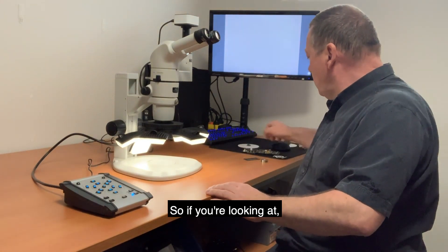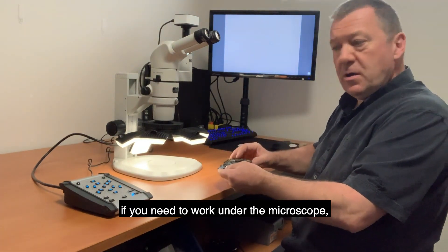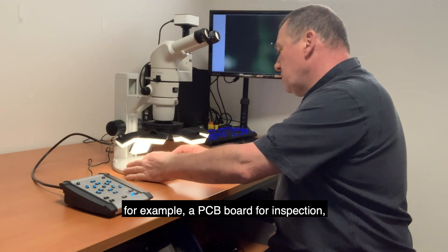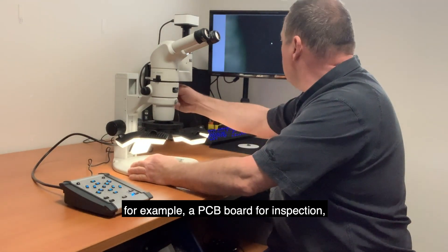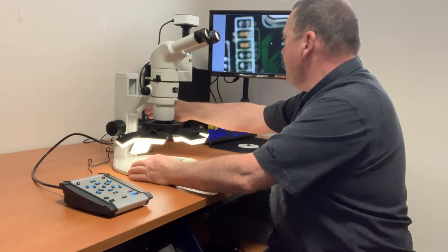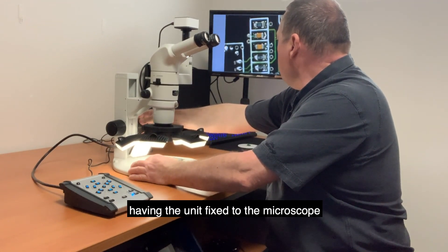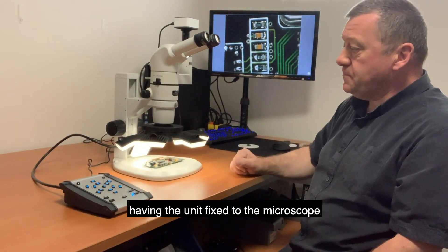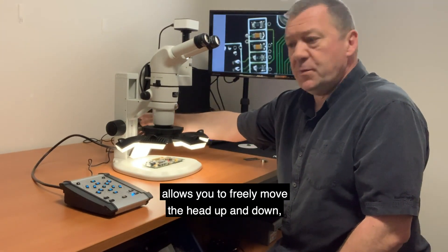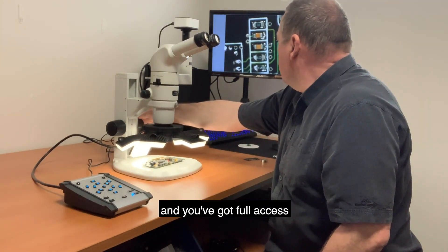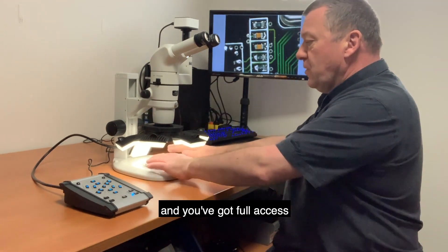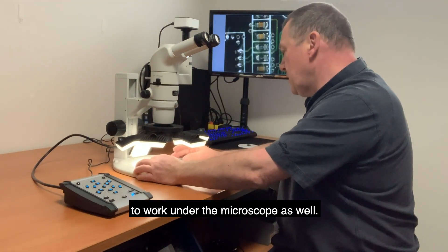If you're looking at, for example, PCB board inspection, having the unit fixed to the microscope allows you to freely move the head up and down, and you've got full access to work under the microscope as well.